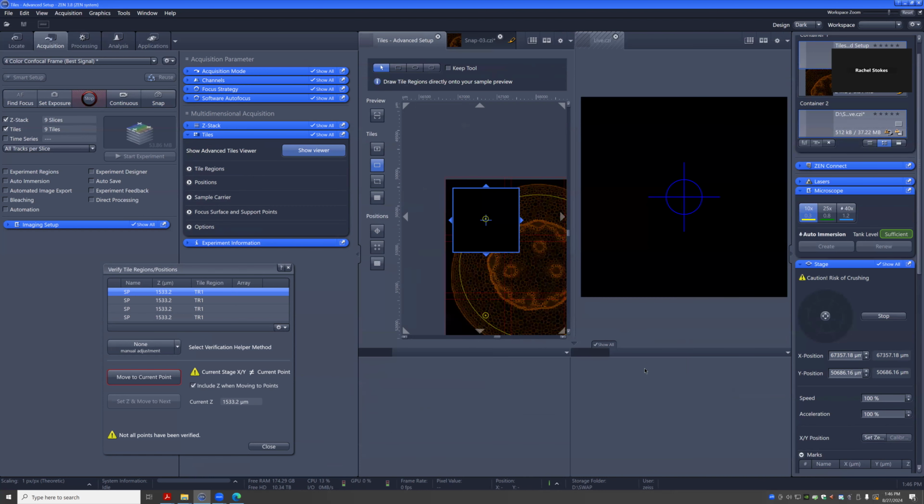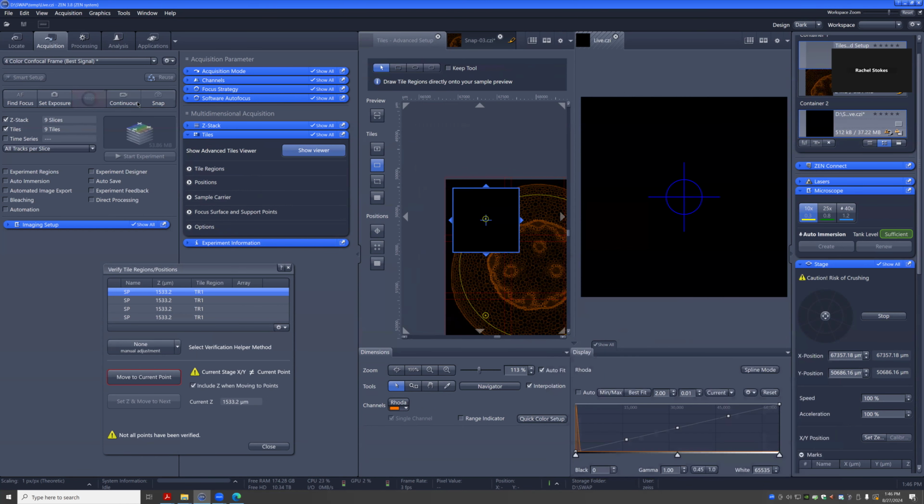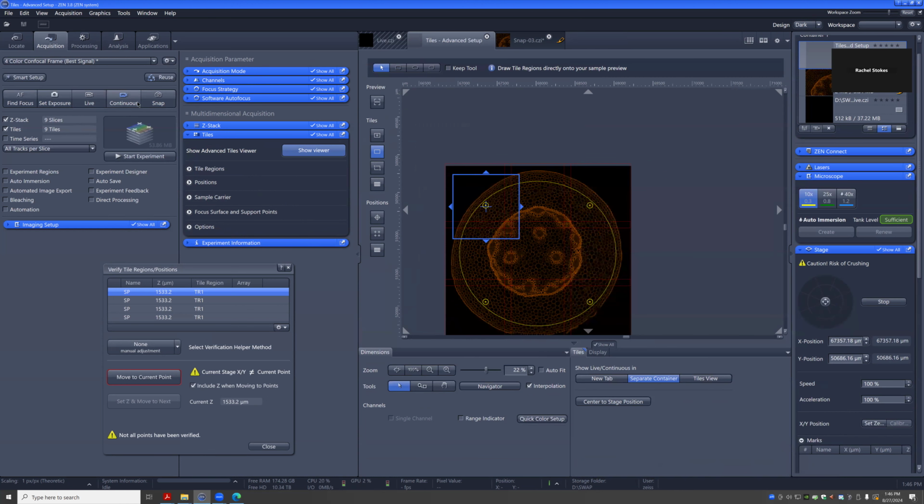scan. Oh, what do we do? Oh, see, that's one way to show. Remember our arm, right? Don't worry, the check. Yeah, we're shooting lasers in the air, but you can see that blocks us from scanning, right? So that's exactly what that does. So that's what it's supposed to do, which is good. So now let's see. Now we should get something.